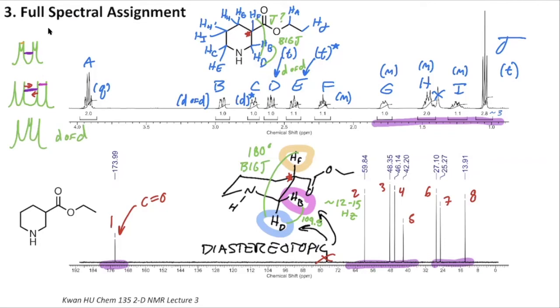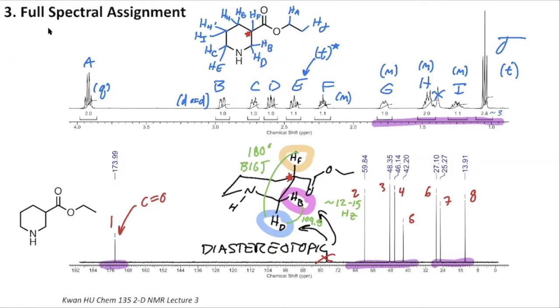You'll have to do a little bit of this analysis for your post lab, maybe not quite to the extent that we're practicing it here, but that's why it's a really good warm up so that you're ready for that post lab assignment. So now that we've made these clarifications, let's go in and actually change our annotations a little bit here.